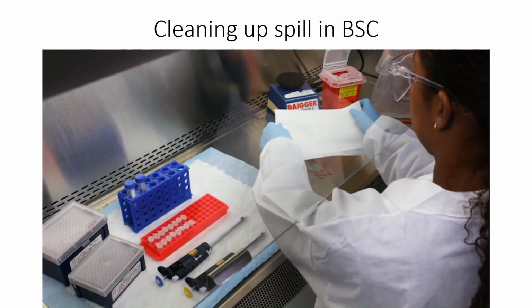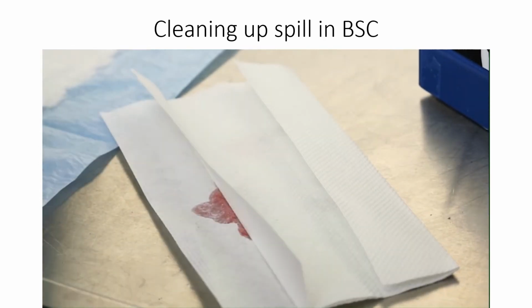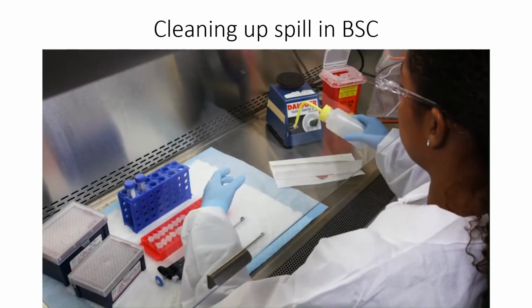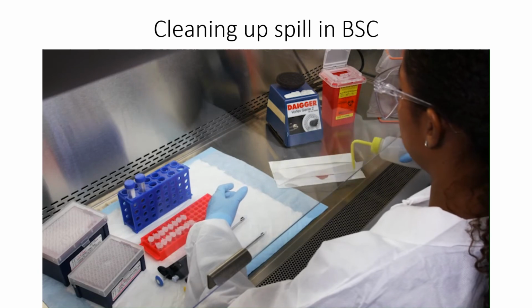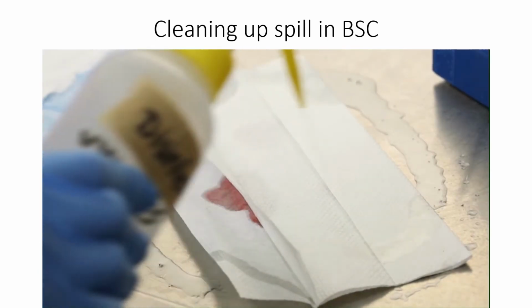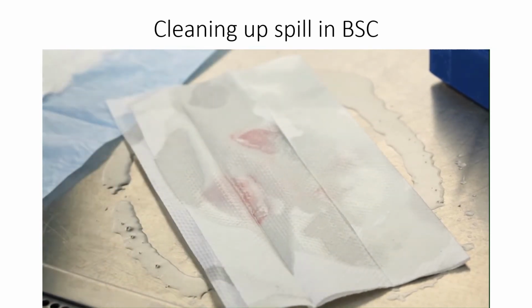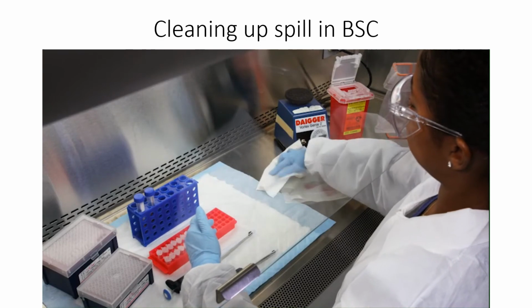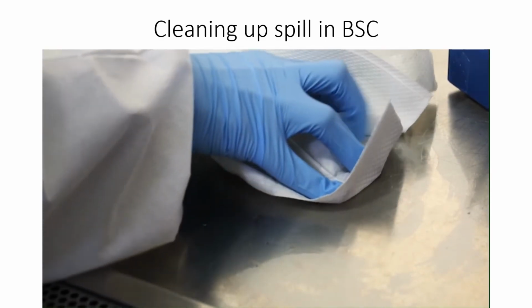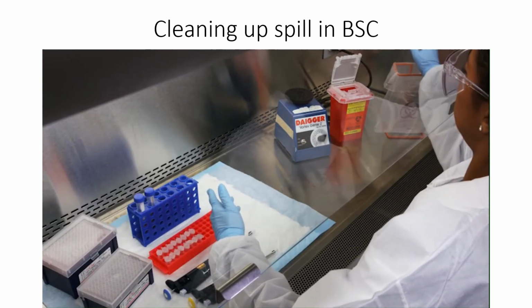The first thing you should do is cover the spill with an absorbent material such as paper towels. Using a plastic squirt bottle, carefully apply the designated liquid disinfectant in your SOP to the absorbent, starting at the outside of the spill and moving toward the center in circular motions. Wipe up as much of the spill as possible and discard the towels in the biohazardous waste container.